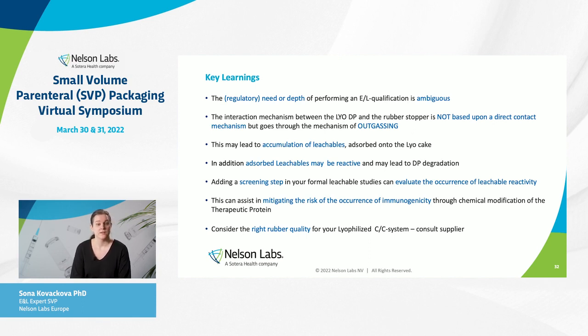So adding a screening step in your formal leachable study can evaluate the occurrence of leachables reactivity. This can further assist in mitigating the risk of immunogenicity, especially if you have a therapeutic protein drug product. And although I mentioned this very briefly, it is very important to consider the right rubber quality or the right match of the rubber with your lyophilized drug product. You can always consult your supplier and ask for help.